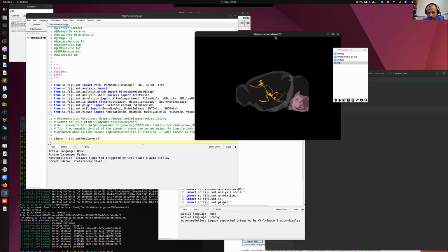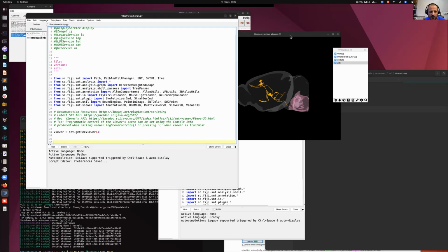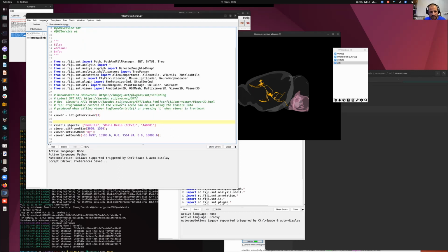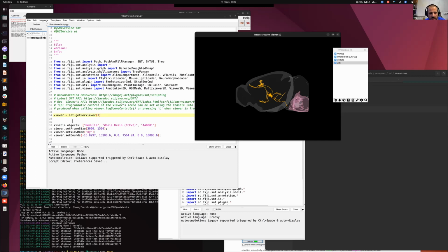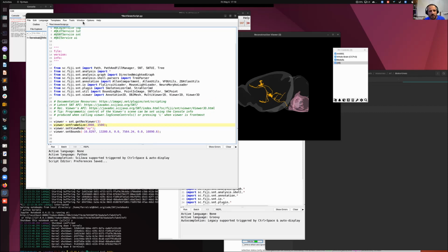There is a command for logging details that presents to the console, which has that minuscule font there. So I'm just going to paste here. When I press L, I'm basically logging the scene properties. It tells you the visible objects are these, and you see that they already know something about the object. We already set the viewer size of the frame, we already set the bounds, the zooming to the region and so on. So that could be quite useful. And we are just going through some of the examples now with the script.